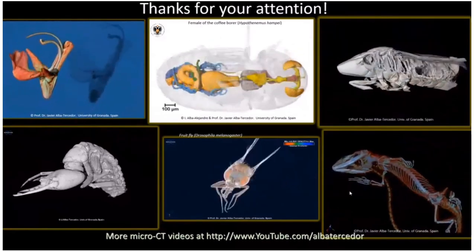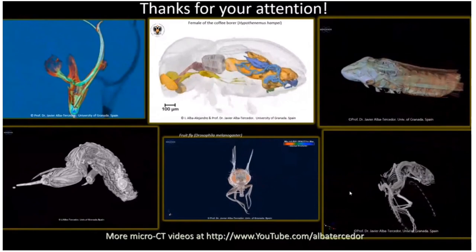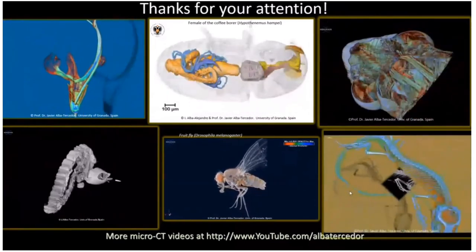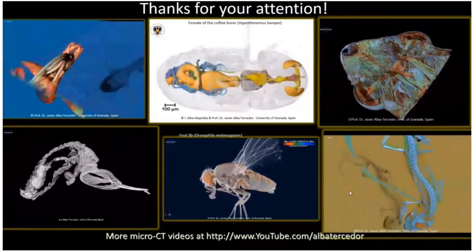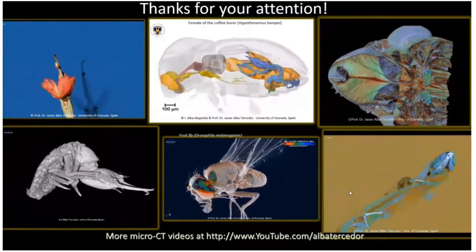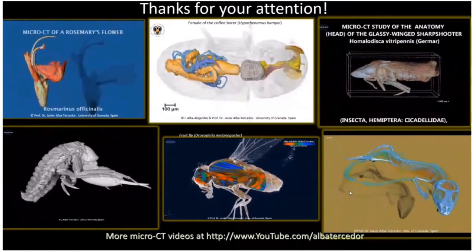More questions. Someone is interested in how you scanned the flower. Did you dry it, or did you scan it without drying? The flower, I put it straightforward into the sampling holder, attached with plasticine, and that's it. It's described in the paper.